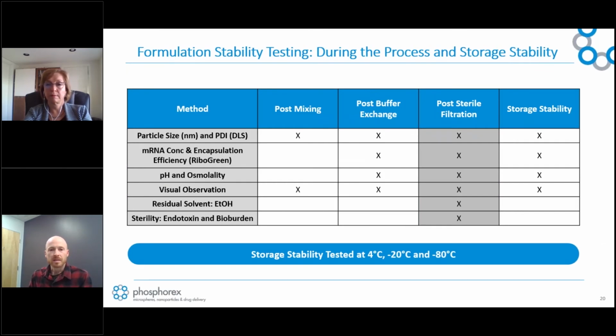And with regards to stability testing, again, this is one of the critical parts of the process. We can monitor certain attributes between various unit operations, say post-mixing, post-buffer exchange, right? Definitely monitoring things like size, but also looking at our encapsulation efficiency and how that might change both post buffer exchange, concentration, and also post-sterile filtration. Are there any trends there? And then finally, looking at residual solvents and sterility testing. And then again, confirming the stability of the products under the appropriate storage conditions, whether it's refrigerated or frozen.